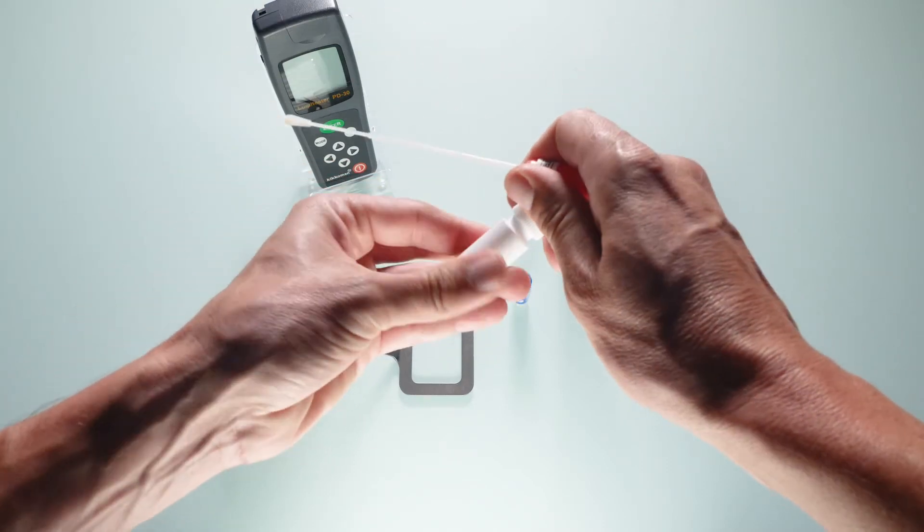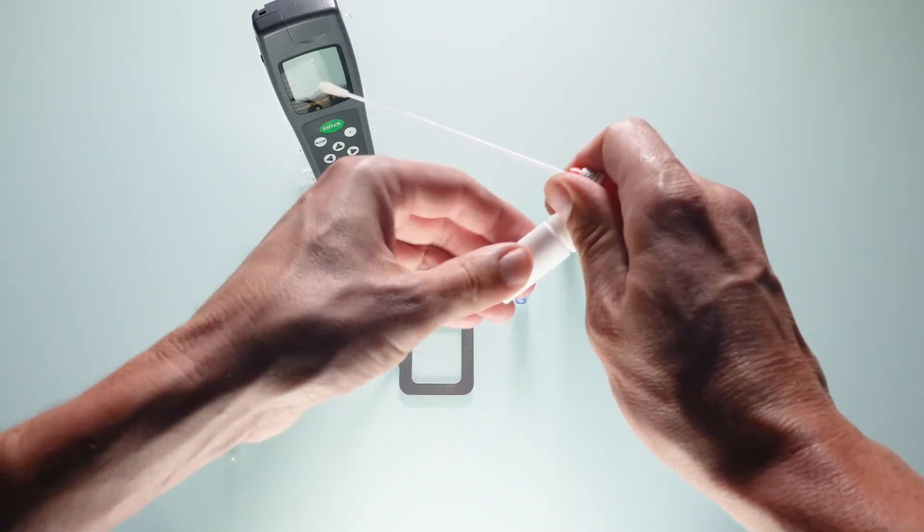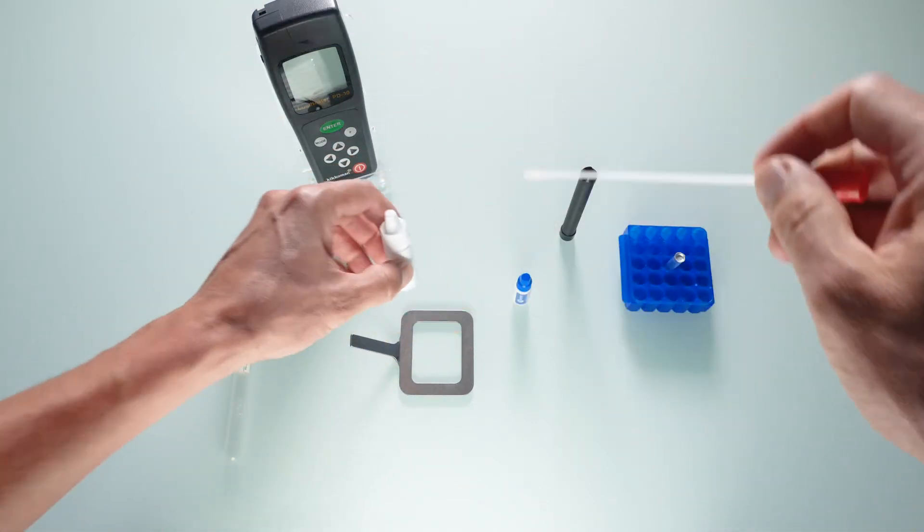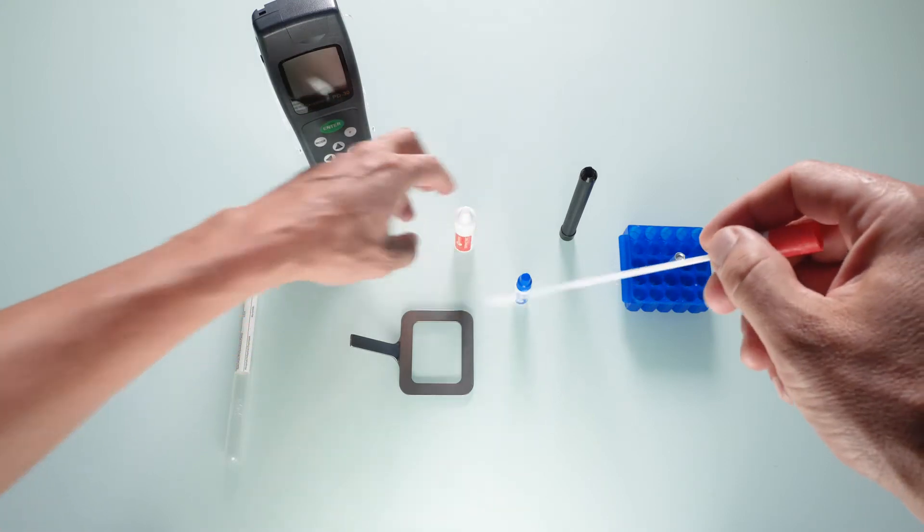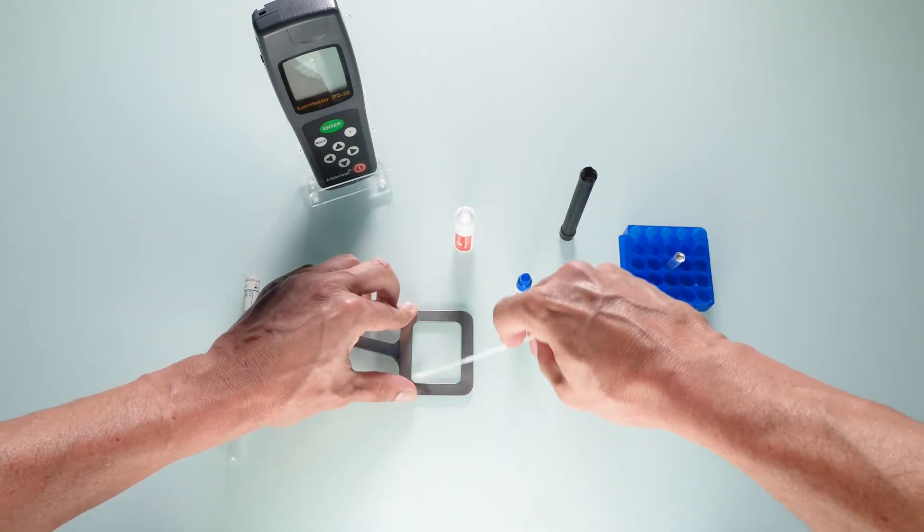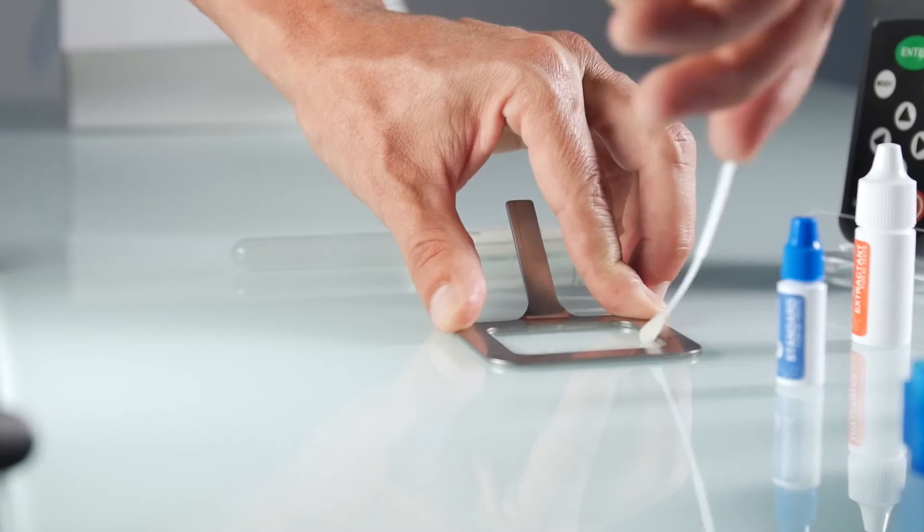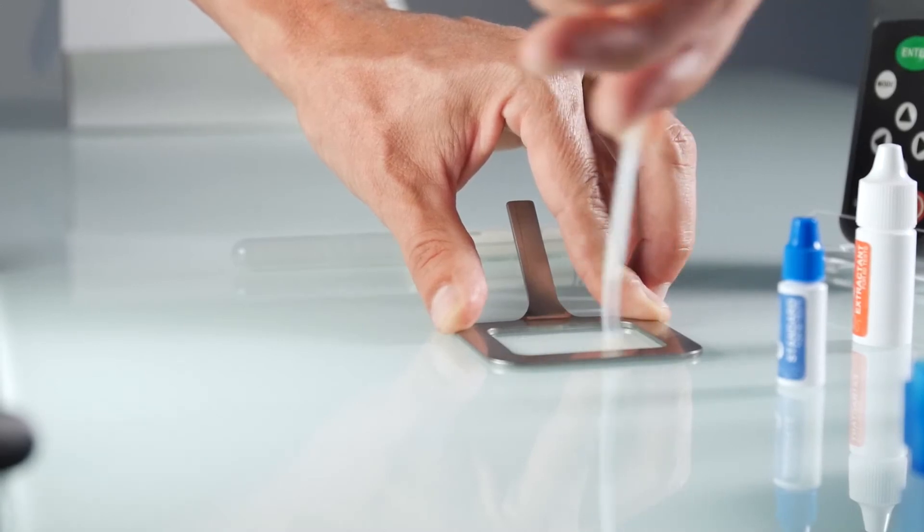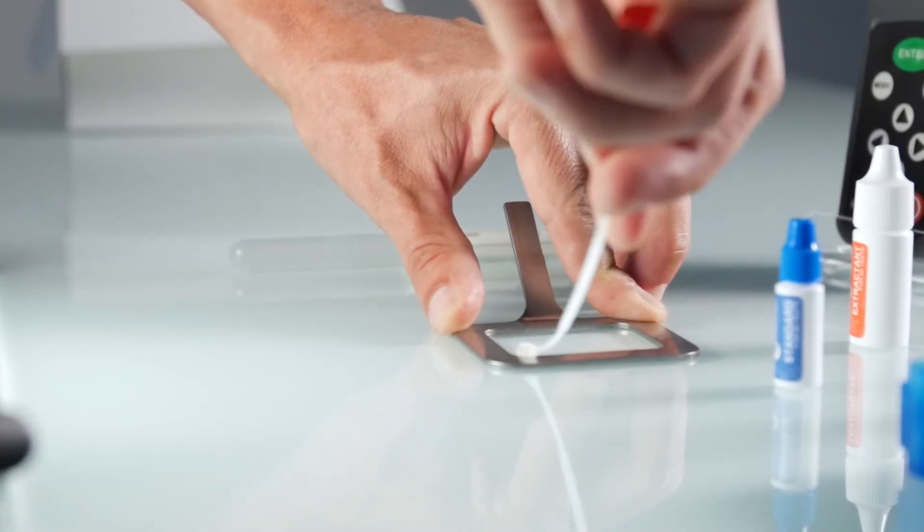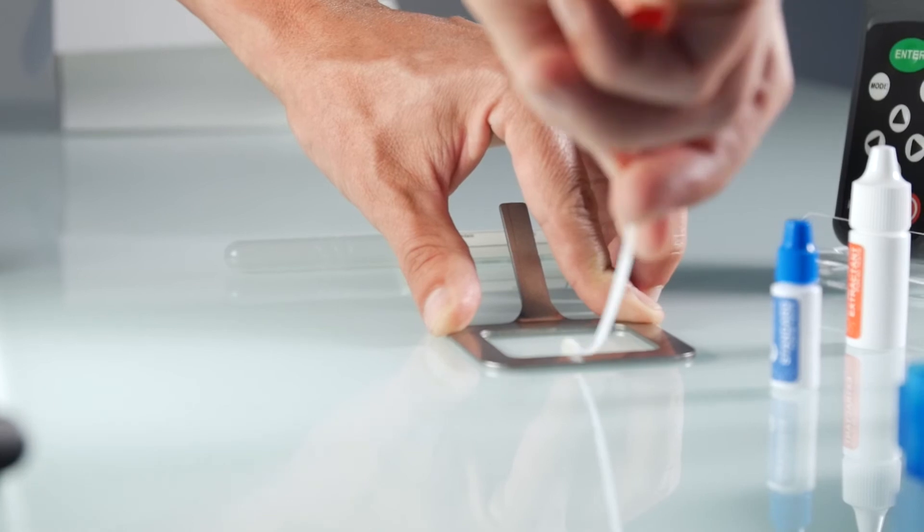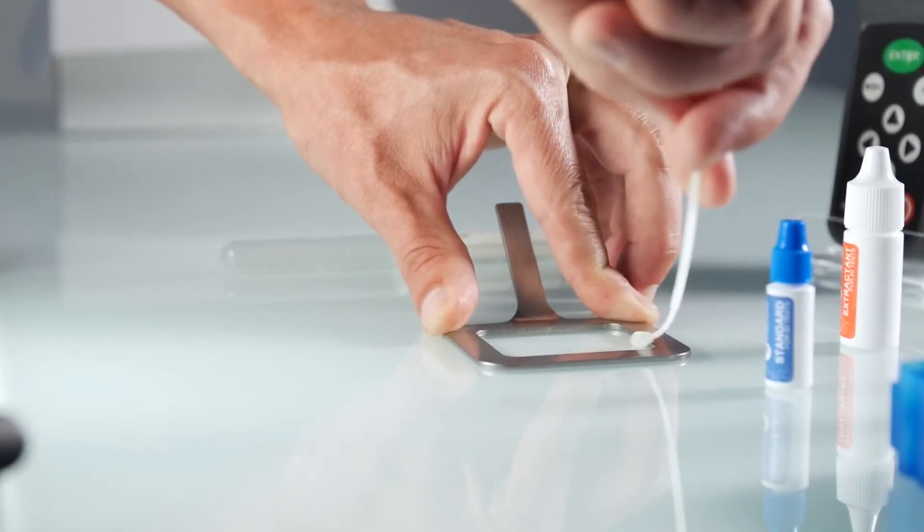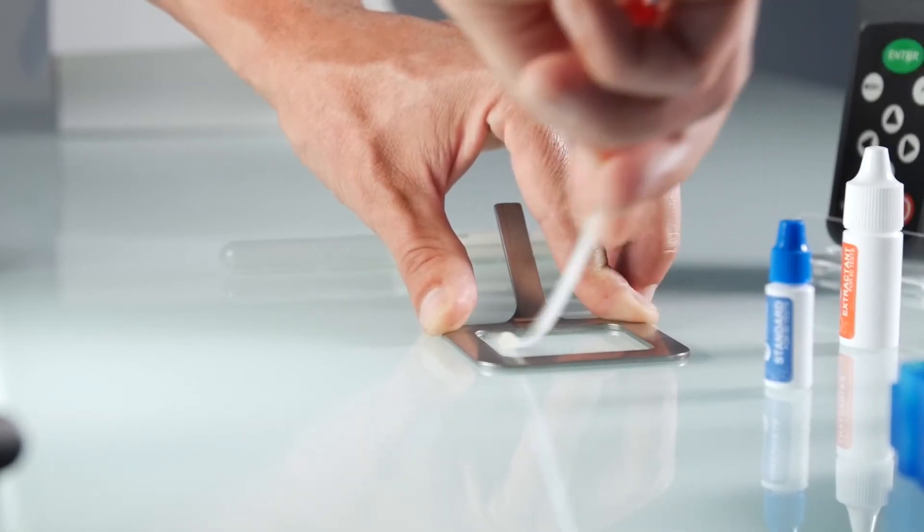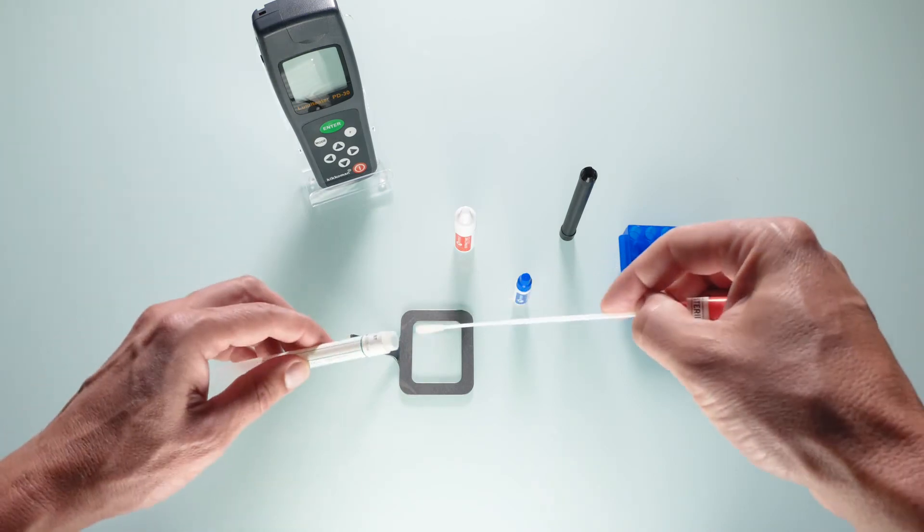Place the disinfected sampling template on the surface. Thoroughly swab the 20 square centimeter surface of the sampling template. Replace the swab in its packaging. The sample is stable for one hour.